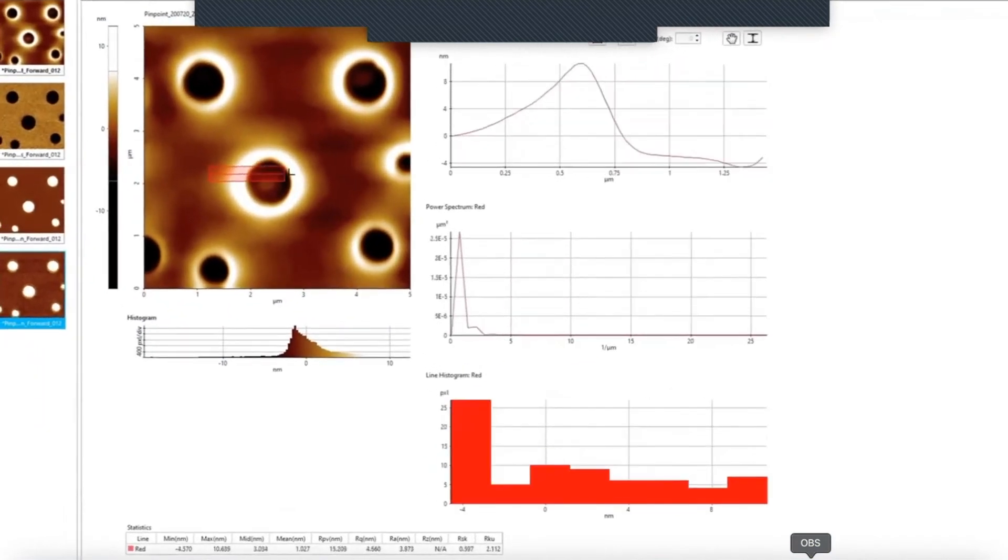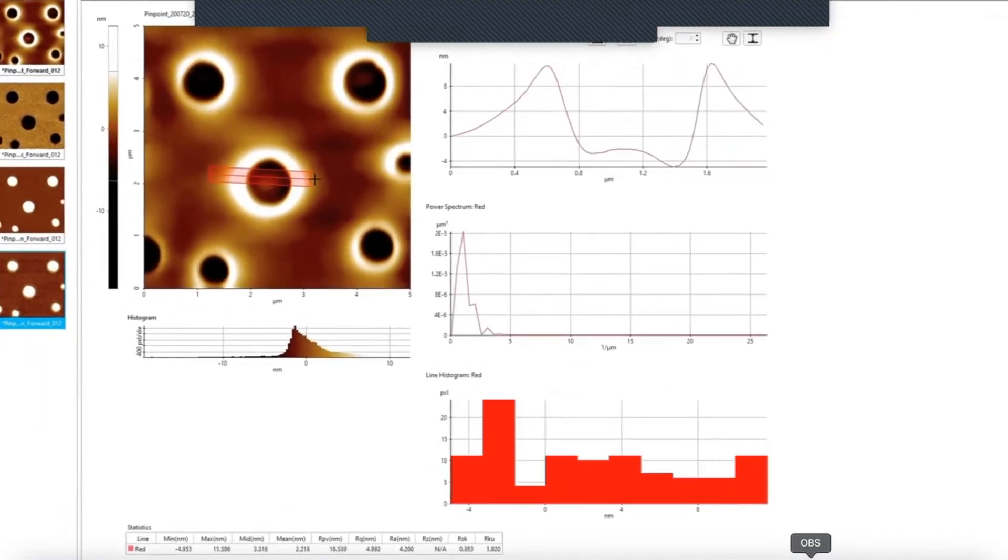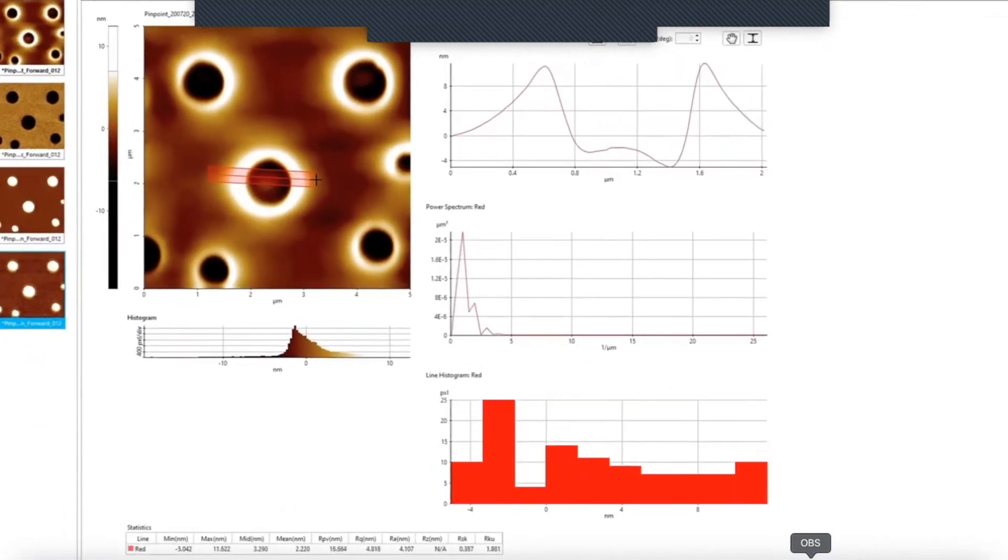Using the line analysis option, you can measure the difference in height across the sample. You can proceed to analyze all measured channels individually.